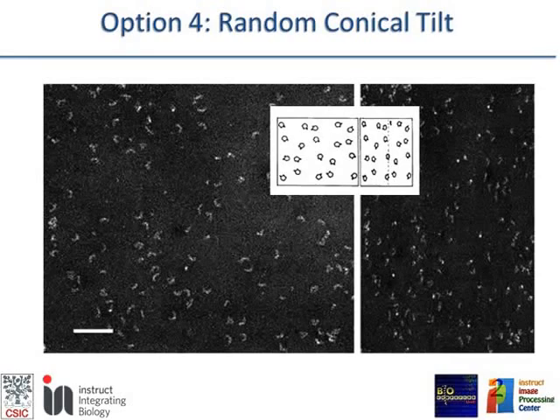So the trick is that you can relate the positions and the angles between each one of the particles. For instance, you may say this particle here is this one here is this one there, and by aligning these particles among themselves, from that alignment and the tilt angle that you know, you can recover the angles that you need for doing the 3D reconstruction.